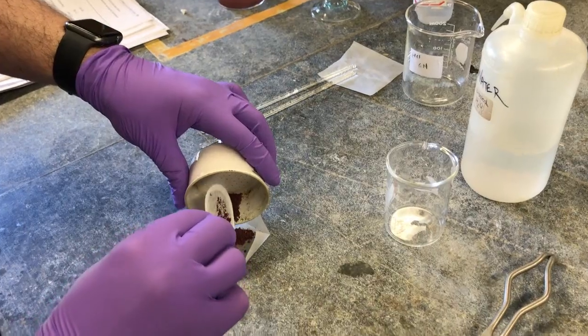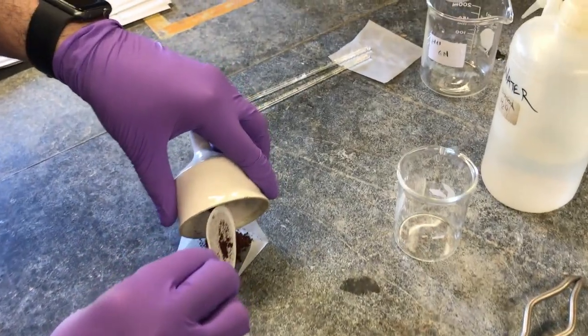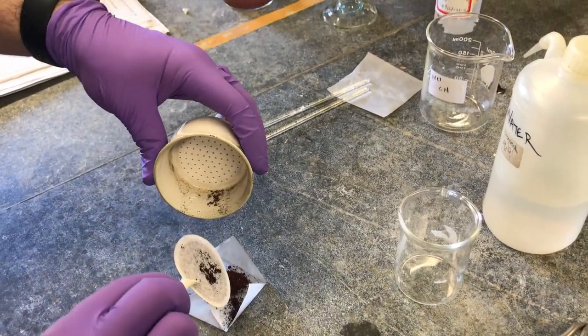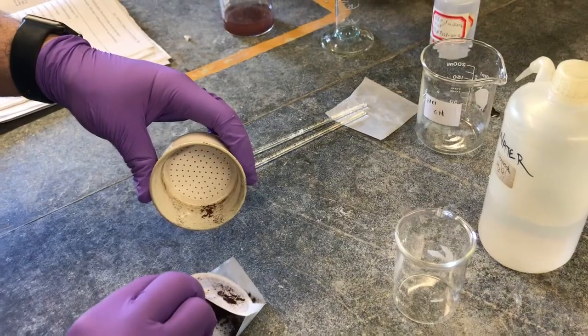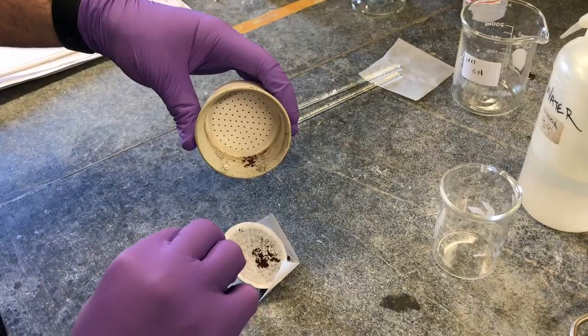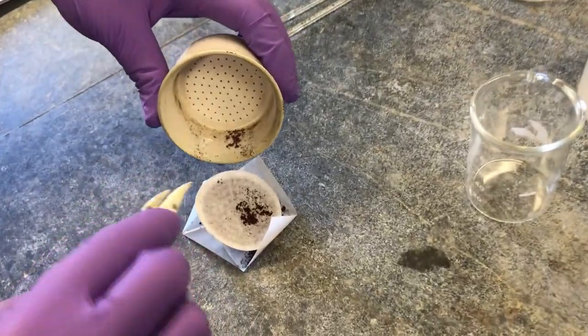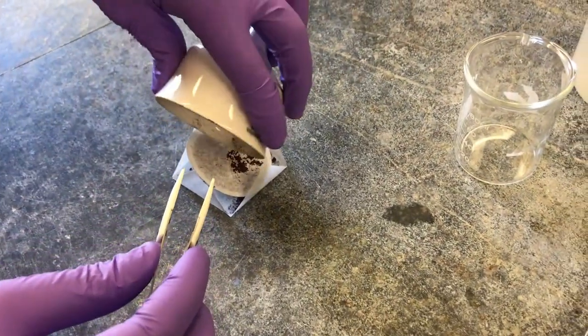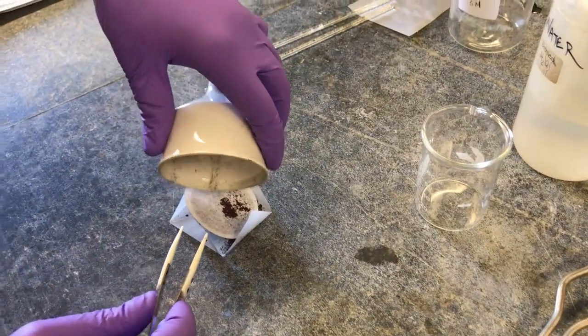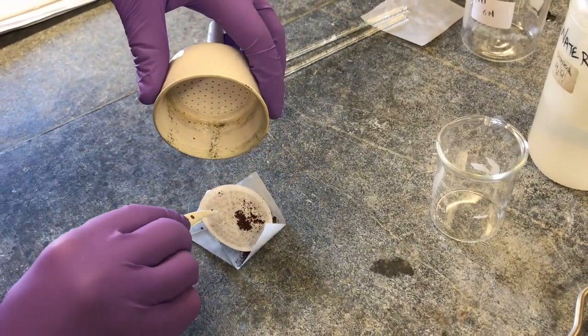I folded the weighing paper slightly so that we have some edges in case the copper starts to go everywhere. That's not a required part of your lab, but I think it's a good way to do it. It's important when you make this little package that you keep the bottom of it flat. This way your copper pours evenly on the center and it's not flopping around or blowing across.